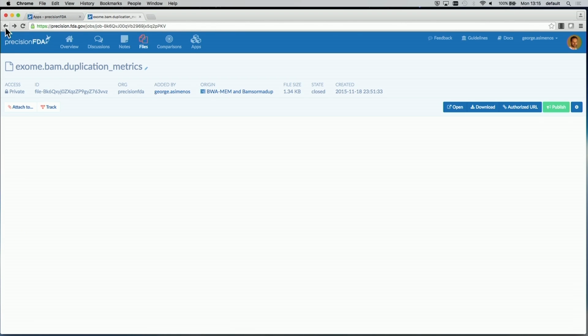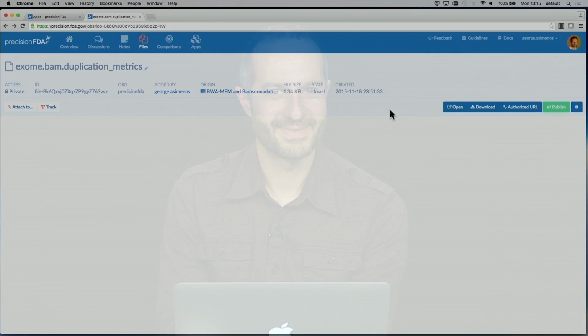Finally, I can share this invocation with others by publishing the job or by attaching it into a note and then publishing the note. Thank you.